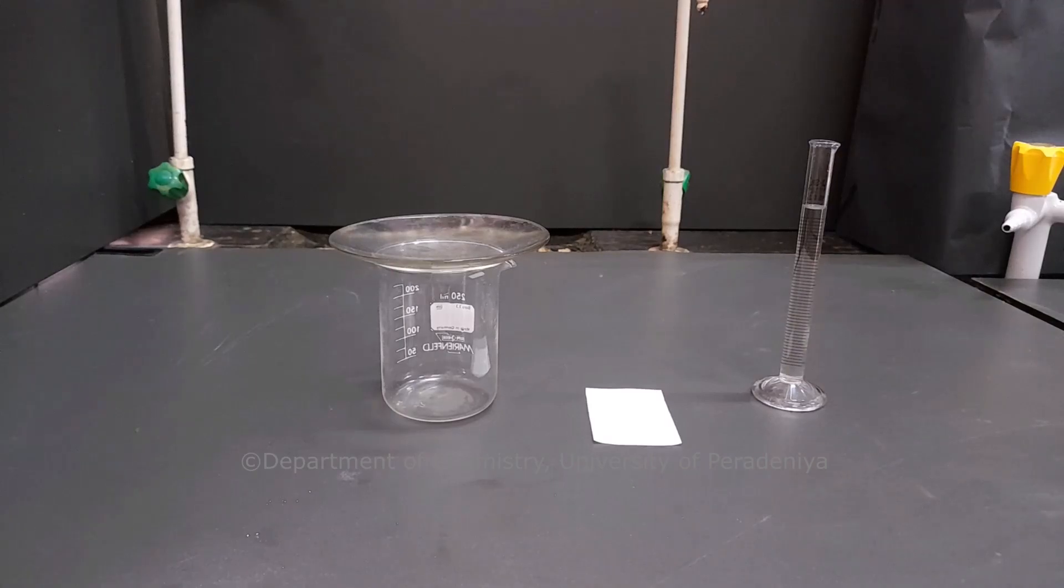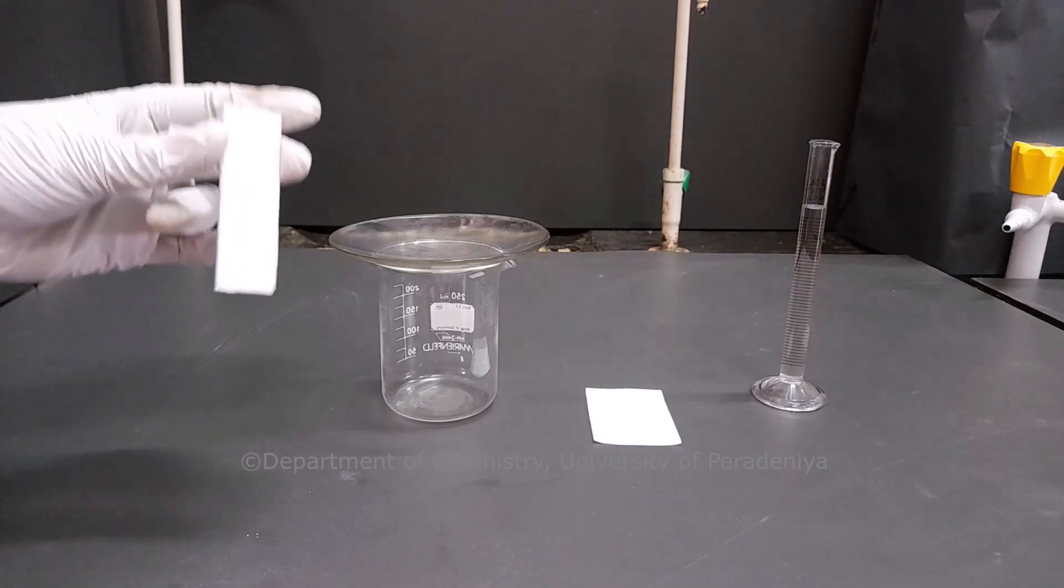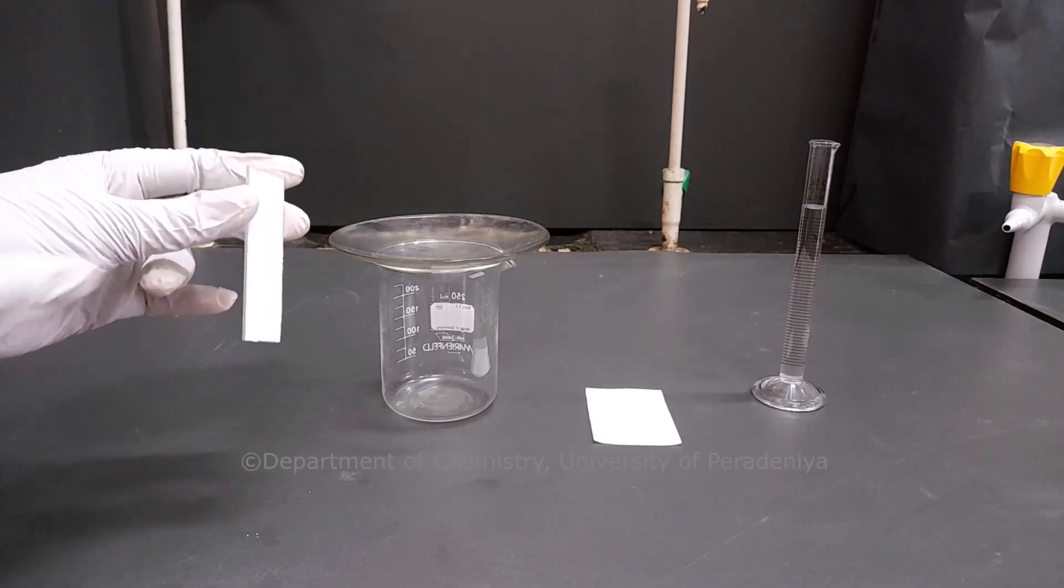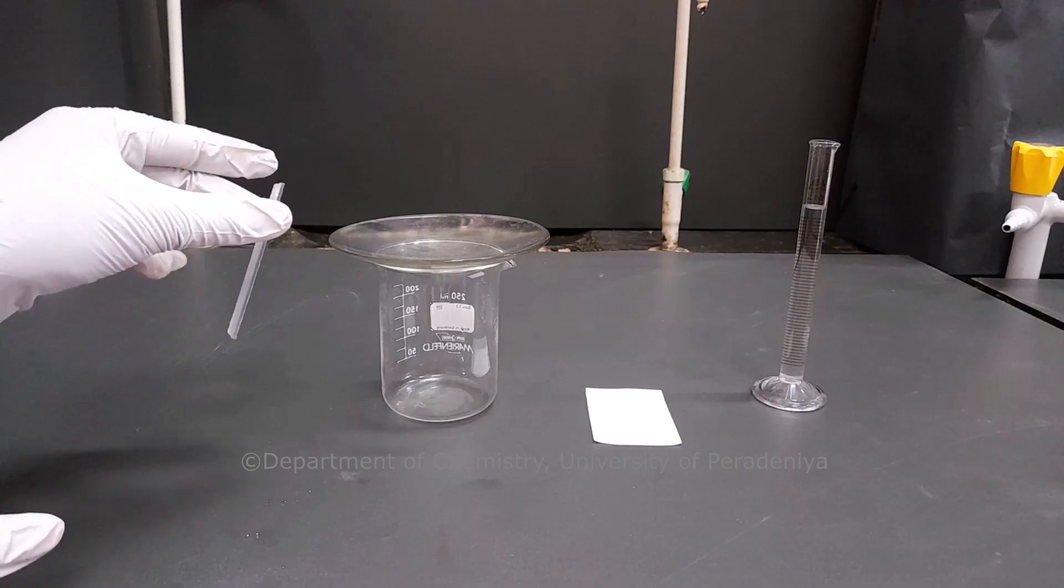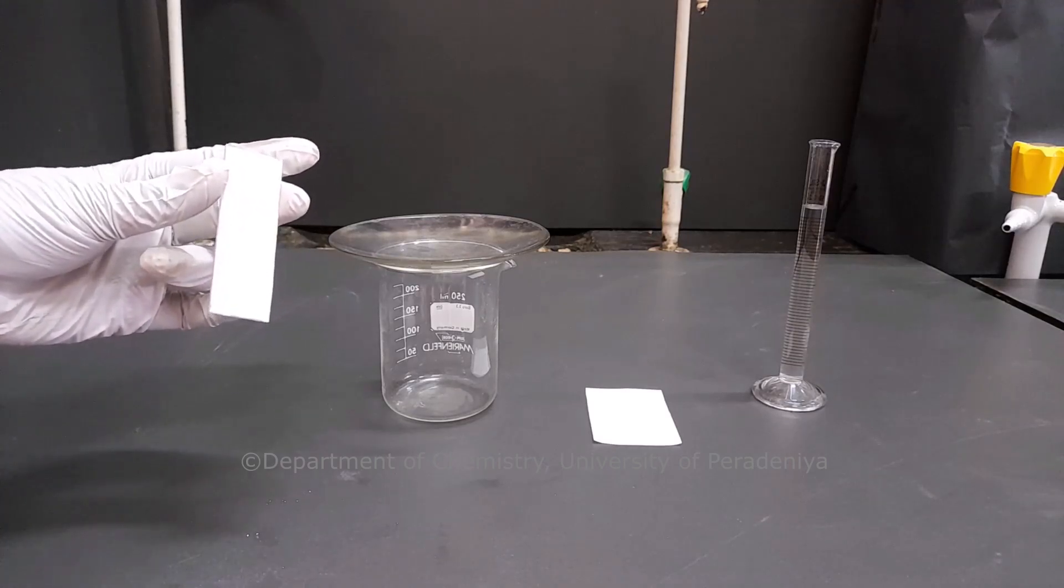There are many types of thin layer chromatography techniques. In this video, we are using a self-made glass plate with silica as the stationary phase. It should be handled only by its edge to avoid contamination.